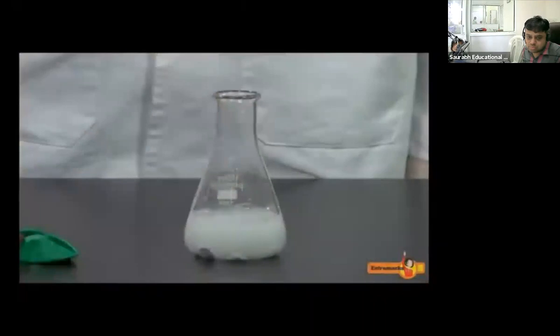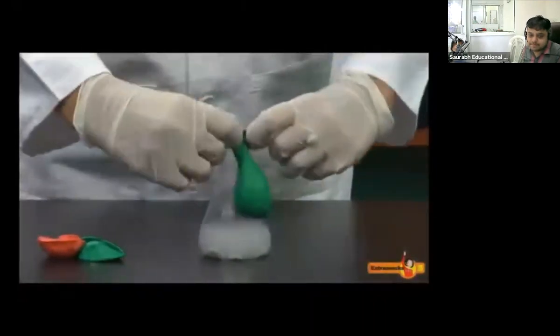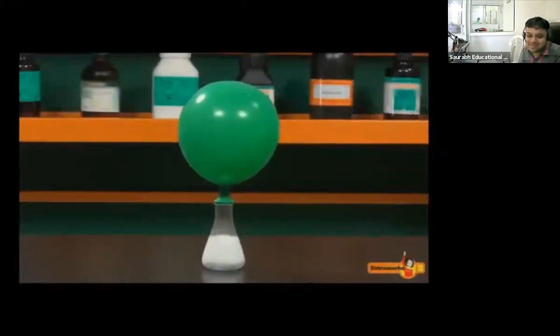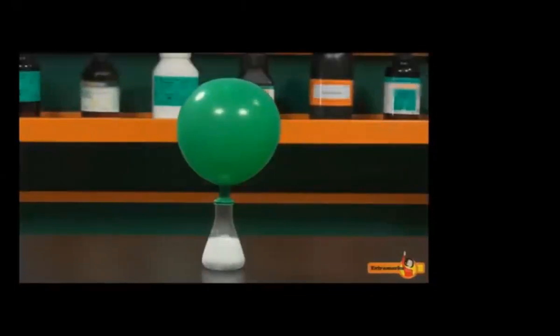Notice the bubbles of gas appearing in the flask. Now, fit a balloon to the mouth of the conical flask. As the gas coming out from the conical flask fills the balloon, it inflates. After some time, the balloon bulges out completely. Can you name the gas which is filled in the balloon? It is hydrogen gas.